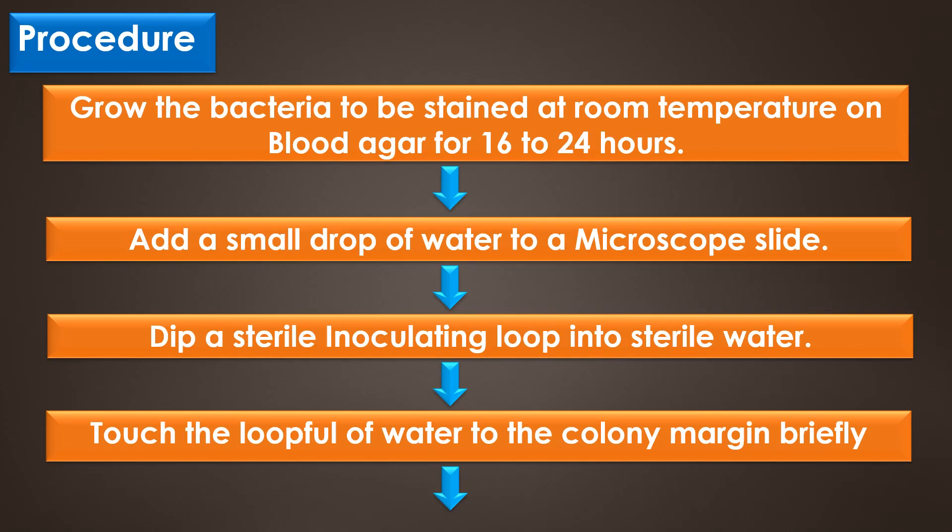First, grow the bacteria to be stained at room temperature on blood agar for 16 to 24 hours, and then add a small drop of water to the microscope slide. After that, touch a loopful of water to the colony margin briefly; this allows the motile cells to swim into the droplet of water.